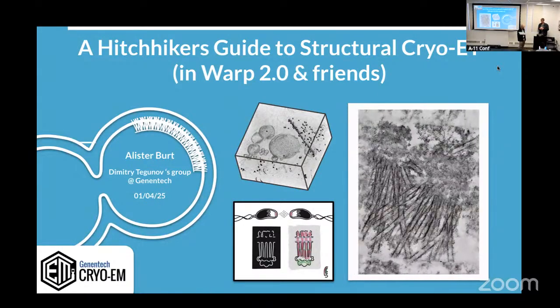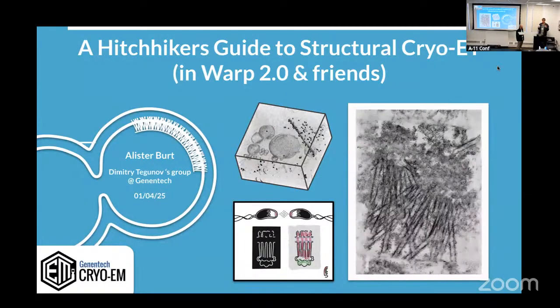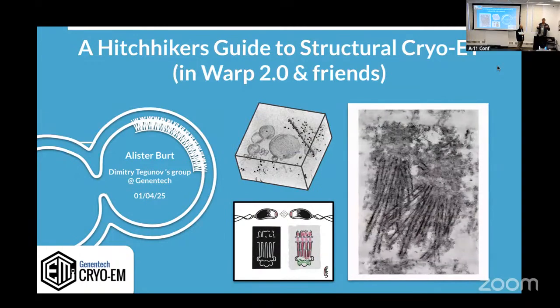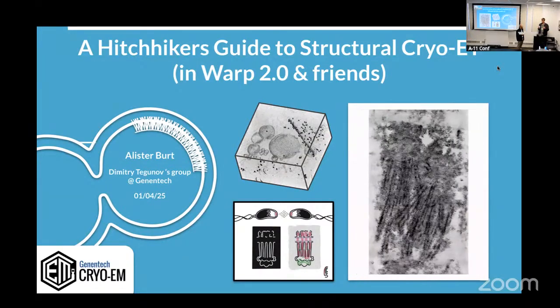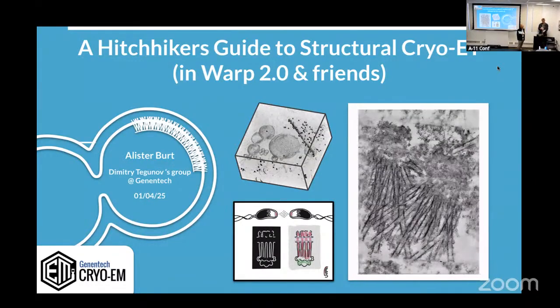What is your favorite part of the workflow? I really love the geometrical aspects of tomography, like you have 3D pictures, and then often leveraging that geometry in your system is the difference between whether or not your analysis works. So thinking about problems a little bit more smartly than maybe the software puts the solution in front of you for, and that takes you to the next level in terms of what you can do. And I've got an example of that.